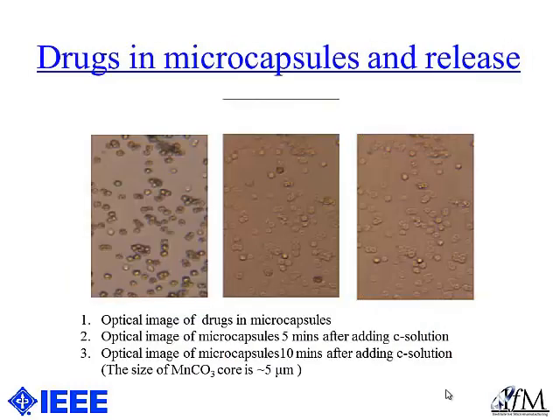Before we flow those drug samples into our device, we do the equivalent experiment on a glass slide. Those images show that, the first one shows that a few seconds after we deliver the control solution into the drug model, the color is still quite dark, which means that the core hasn't been dissolved. The second one shows that after 5 minutes, most of them have dissolved, but some are still dark, which means the core hasn't dissolved. And in the third image, taken after 10 minutes, you can see that all of the microcapsules are transparent.